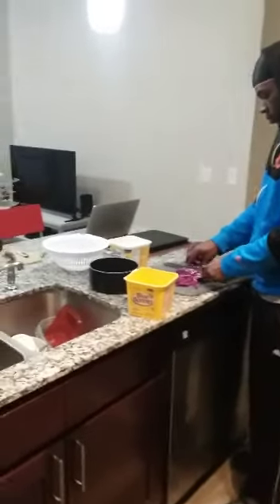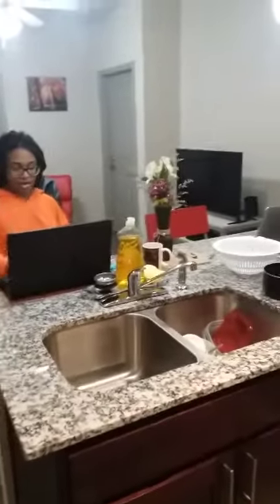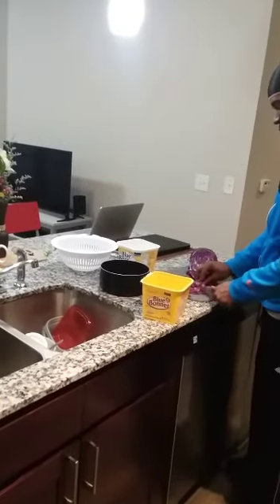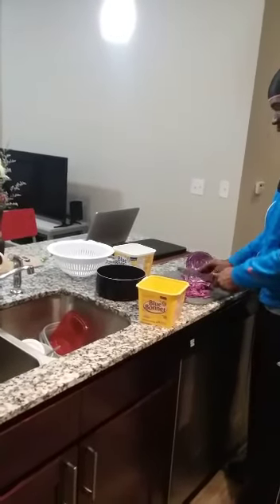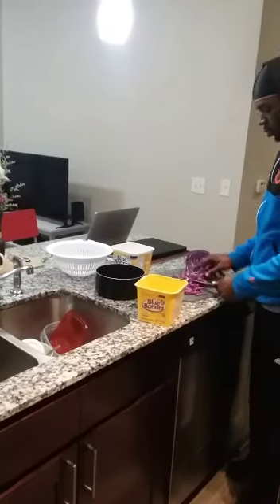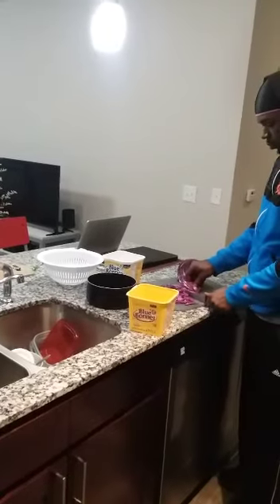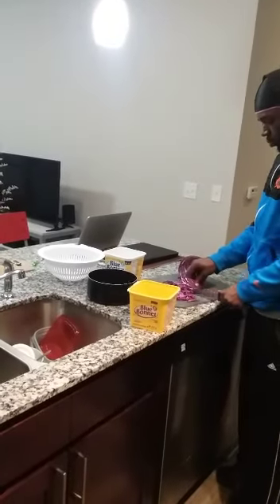So he is finely chopping the cabbage that we're going to use as our pH indicators. And once he is finished, we're going to put the cabbage into the water and we're going to set it to boil.